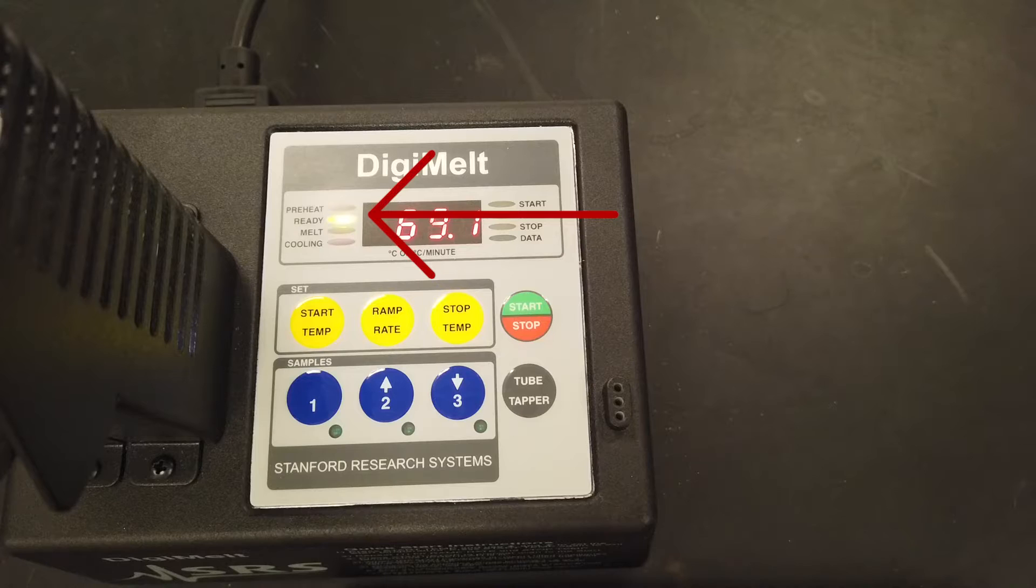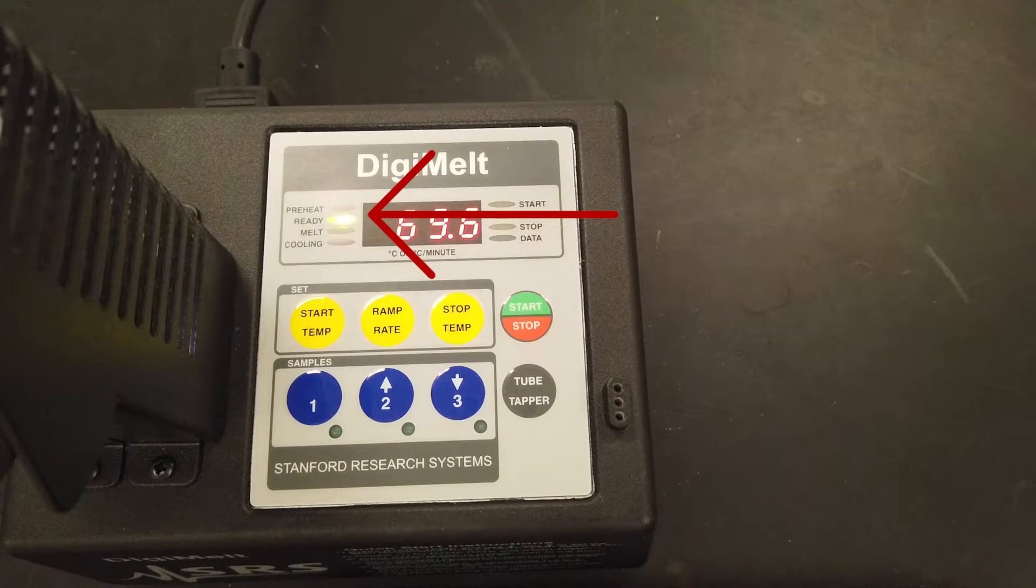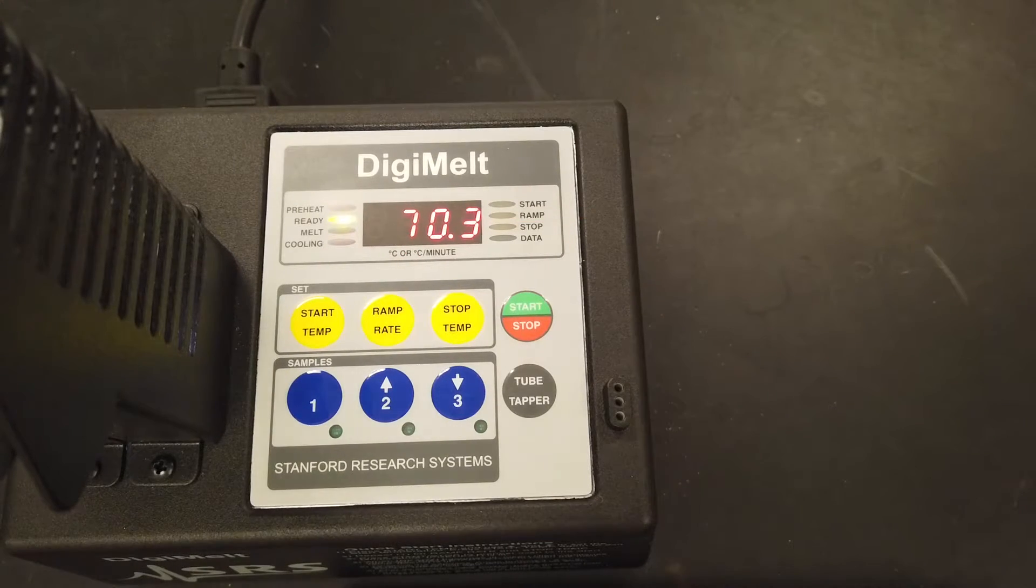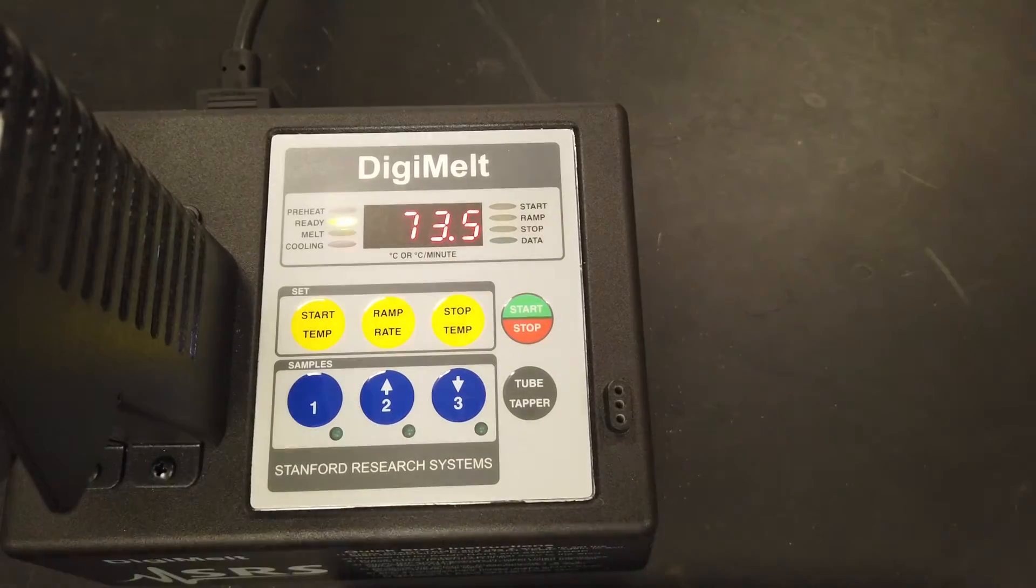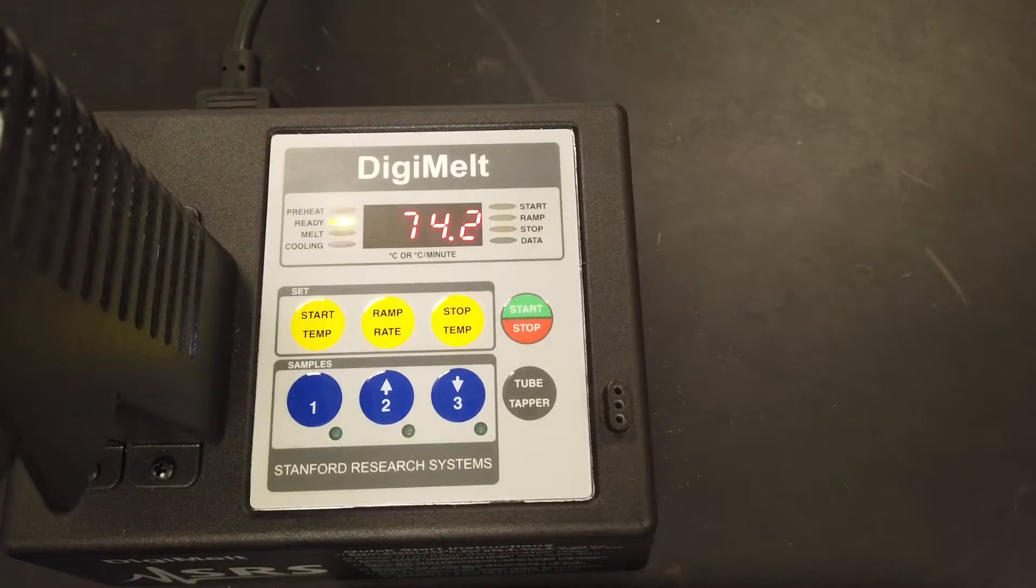Once the apparatus is up to the start temp, a green light will illuminate next to the ready mark. The Melt-Temp will stay ready until you press the start stop button. When you're ready to begin, press the start stop button and the Melt-Temp will switch to melt.